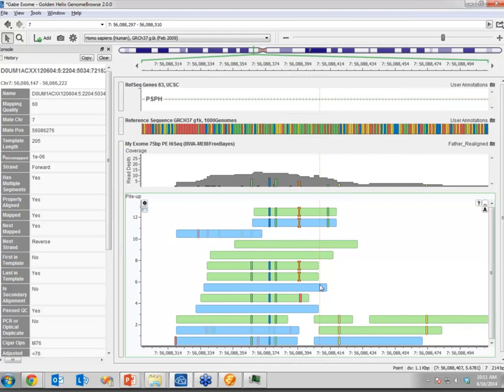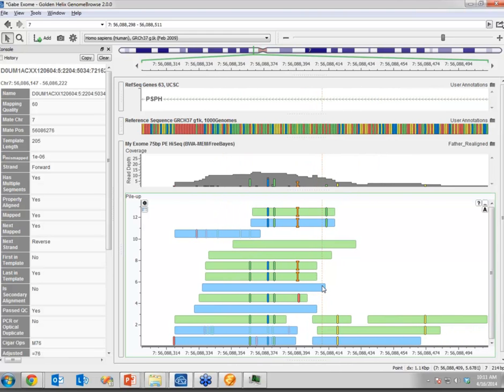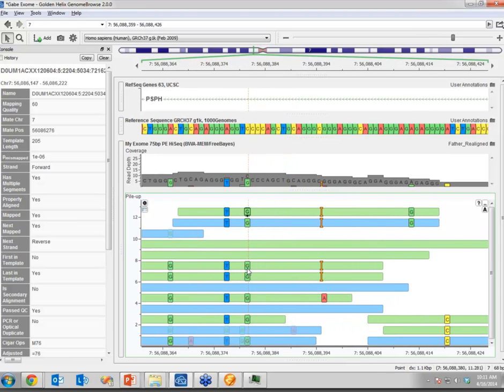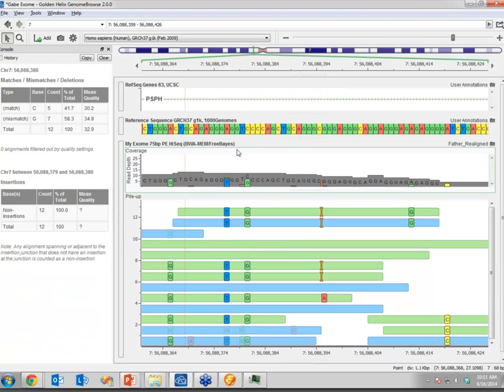Okay, so this is why the alignment algorithms are something we're talking about today, because these simple reads that have no changes to the reference are the easy ones. The harder ones are where there are legitimate differences to the human reference genome. In this case, the reference is a C, and there's a mismatch, a single letter change, to a G. And if you stack up a bunch of those changes, you can see I have 12 reads at this region, and 7 of them have that G.